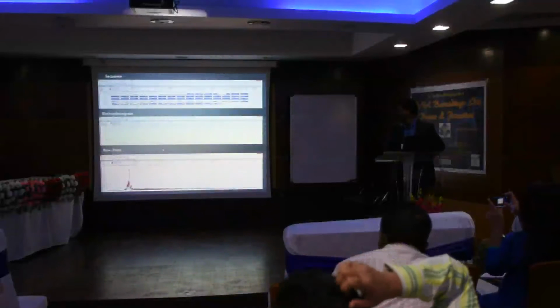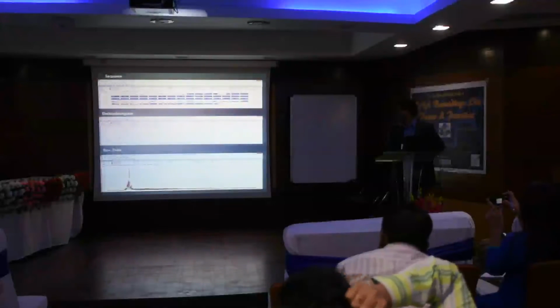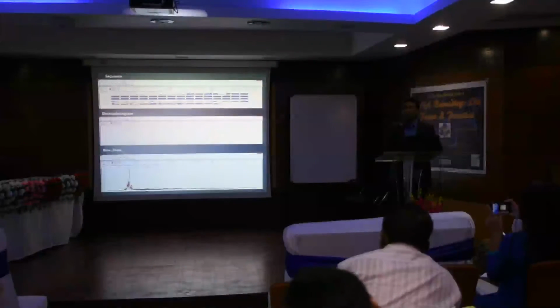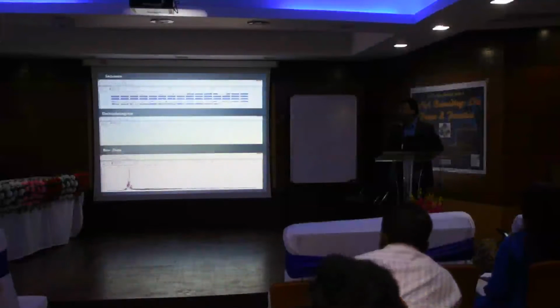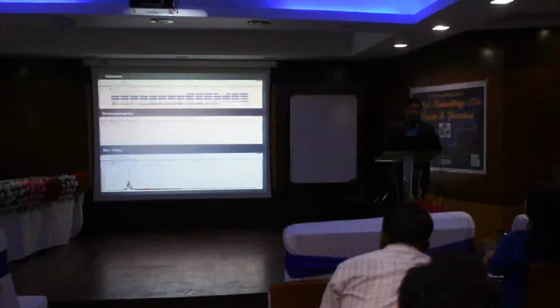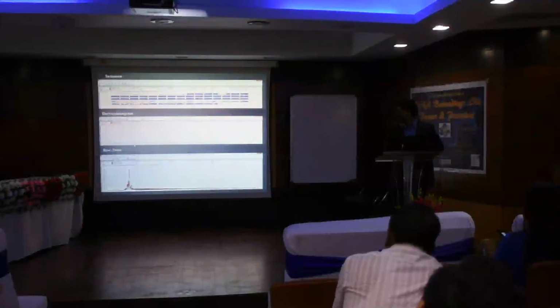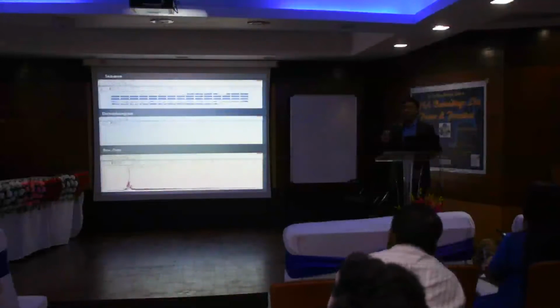And in this case, your electropherogram is like this. This base quality is very poor, no use. Sometimes companies may typically have such types of sequences. Typically, a private company is using this sequence, and then you don't know what to do with that, and you feel happy, I am having something. You tell your colleagues that I sequenced this many numbers, and feel very proud of that. But if you send it to some technical person, they will say this is rubbish.